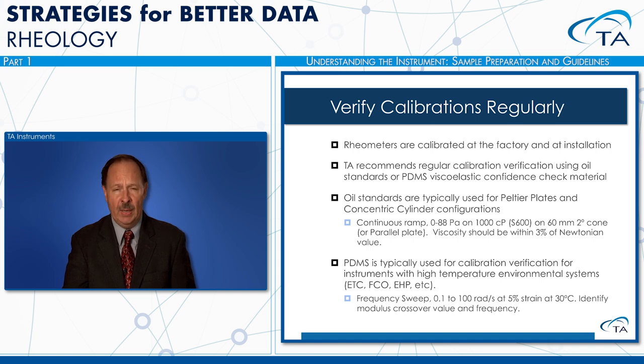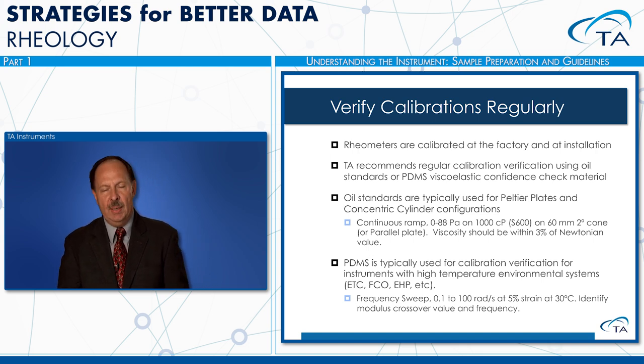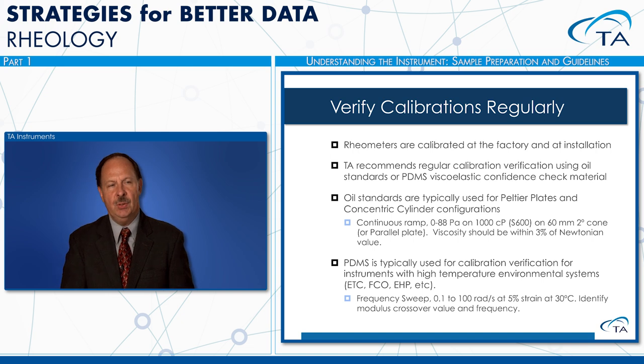You can check for a few vendors online. You can get polydimethylsiloxane from us, which we have characterized on rheometers that we know are very much in spec, and we will provide you certain parameters that, if you are within that range, you can have confidence in the measurements from your rheometer. You can also get oil standards if you're looking at characterizing the Peltier plate or the concentric cylinder.